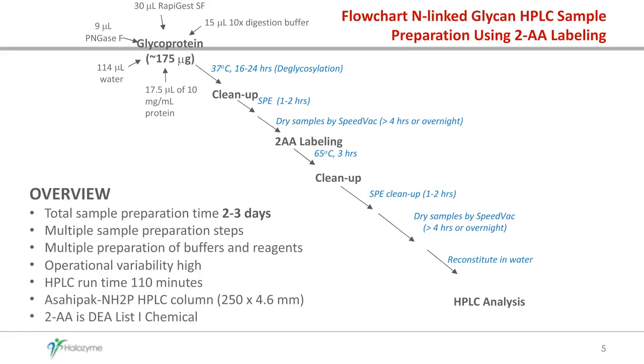And with so many steps, there are multiple buffers that need to be prepared, and also in some of those cleanup steps, we see high variability in the amount of excess dye that stays in there. So it is a good method, it is a validated method, but it is pretty labor intensive. And one more thing I wanted to mention, of course, is HPLC, so we do have to condition our columns, and that takes an additional amount of time as well.